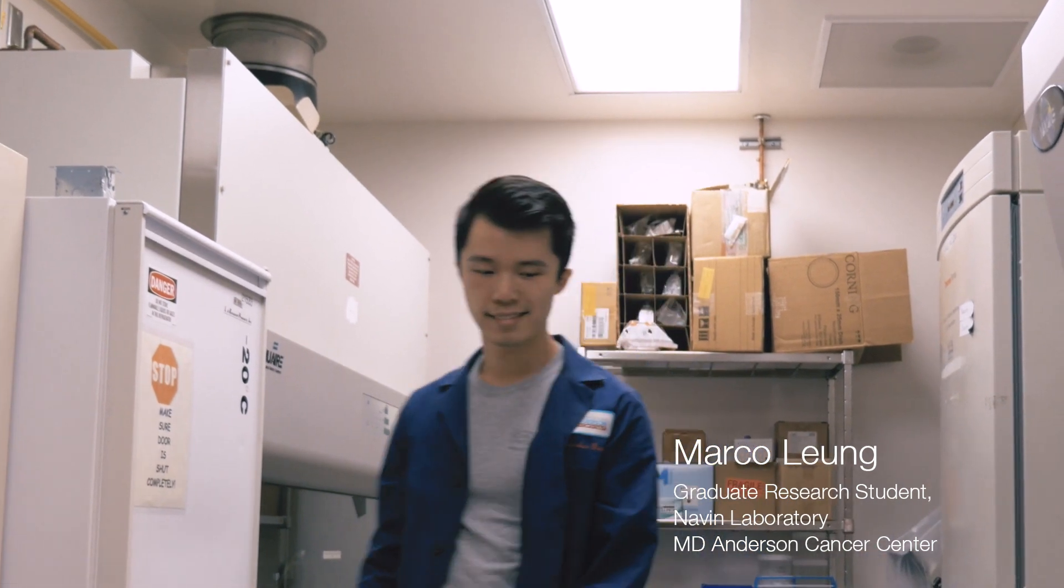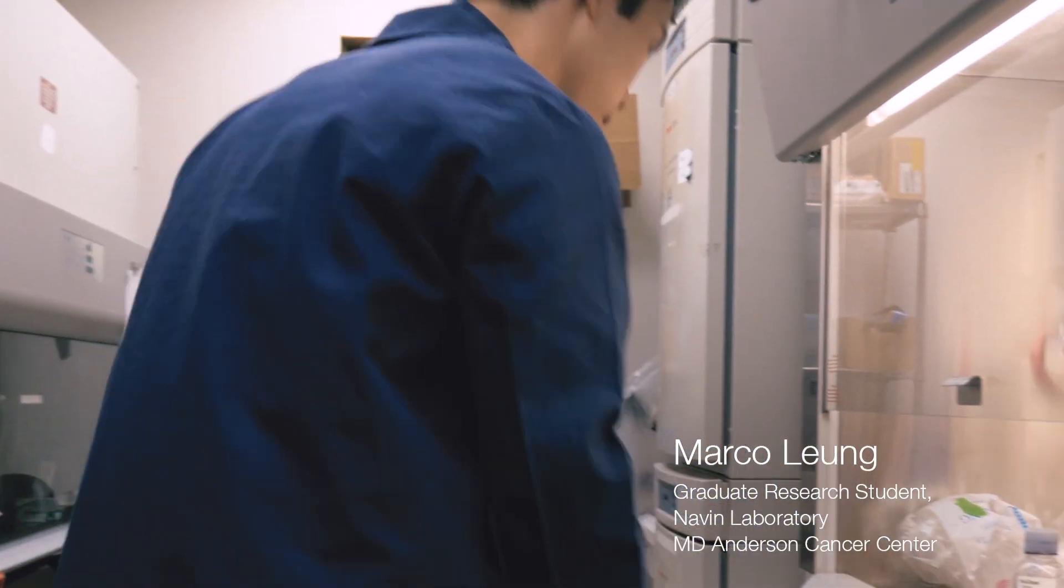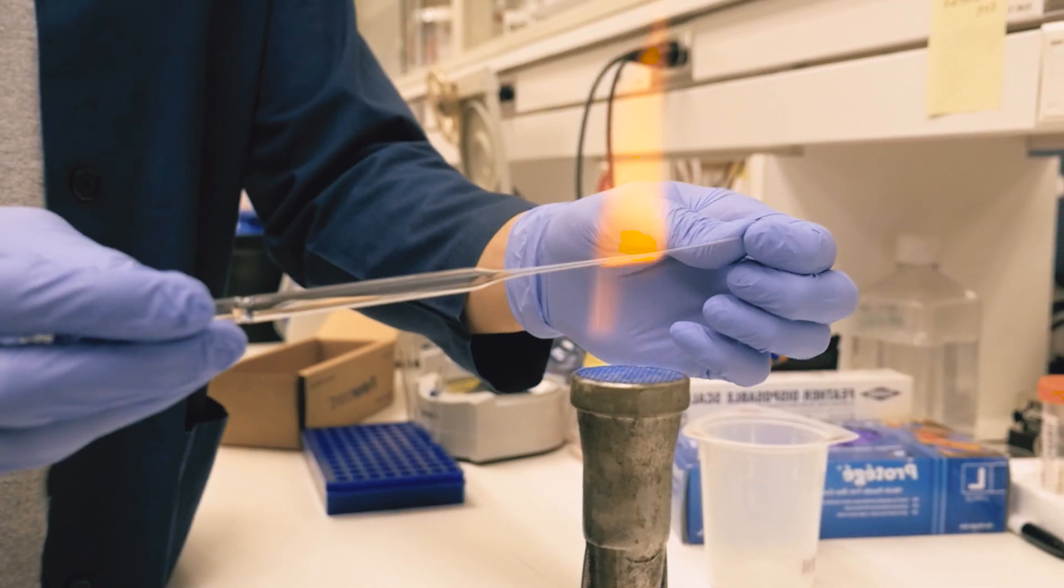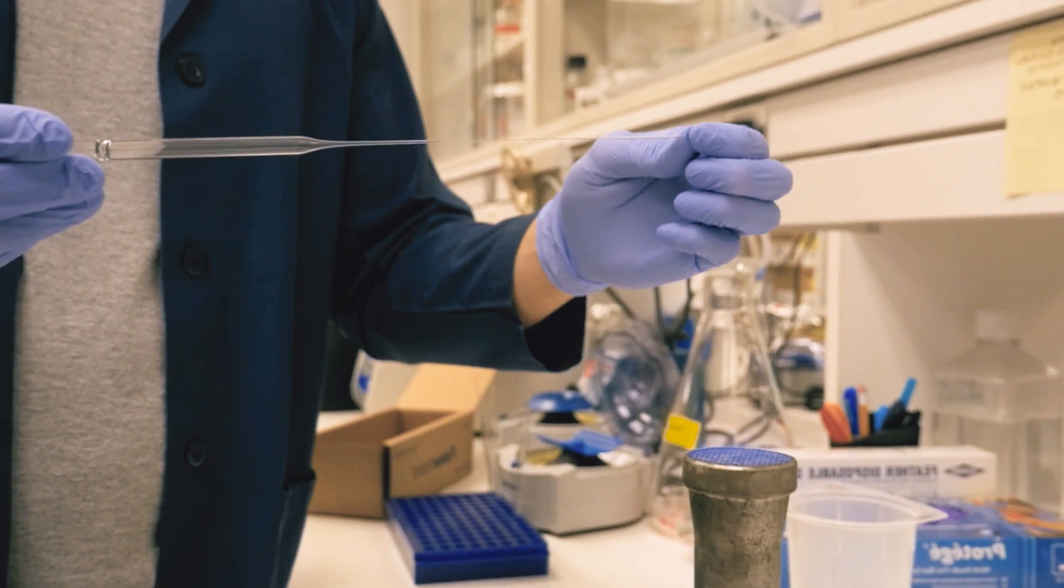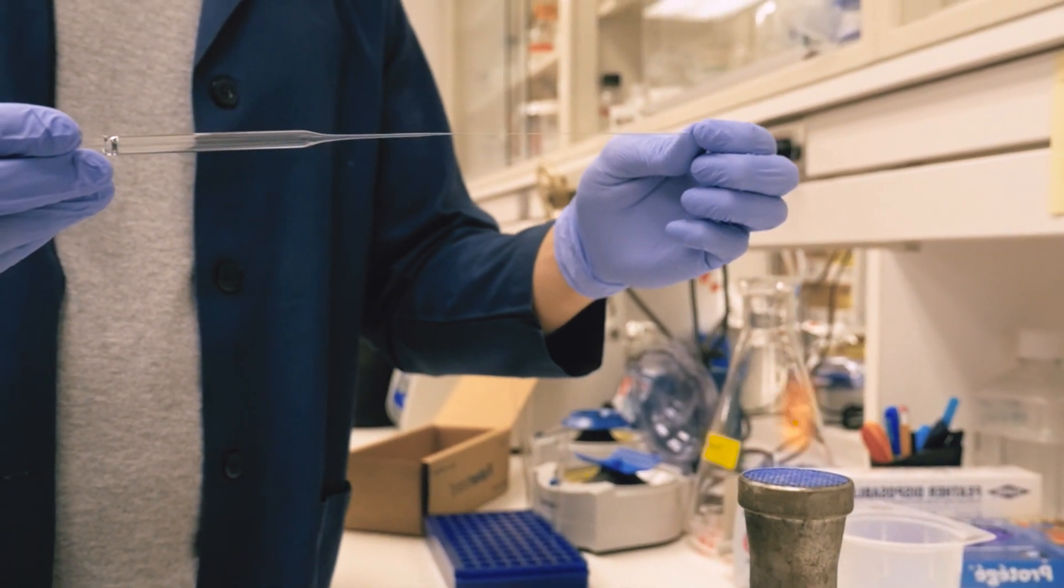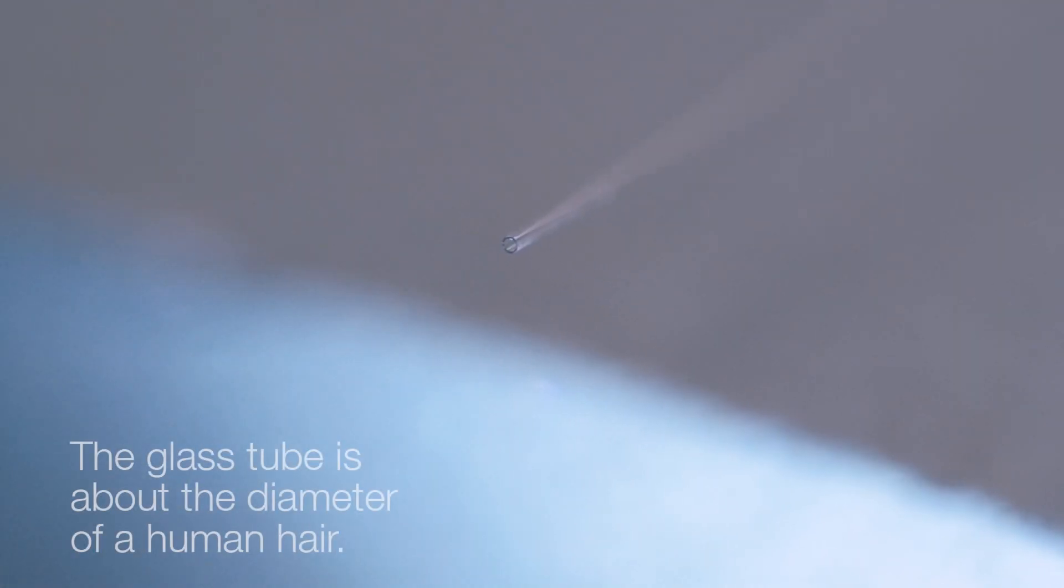So we're going to join Marco now here, who is a graduate student in the lab, and he's going to show us how to do micromanipulation by mouth pipetting to isolate single cells for sequencing analysis. So first, Marco is going to take one of the glass pipettes. He's going to place a plastic tubing that will connect to his mouth so that he can have some input and output pressure.